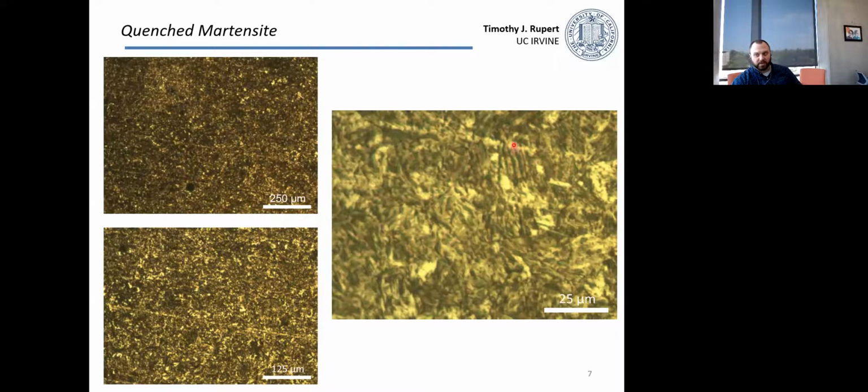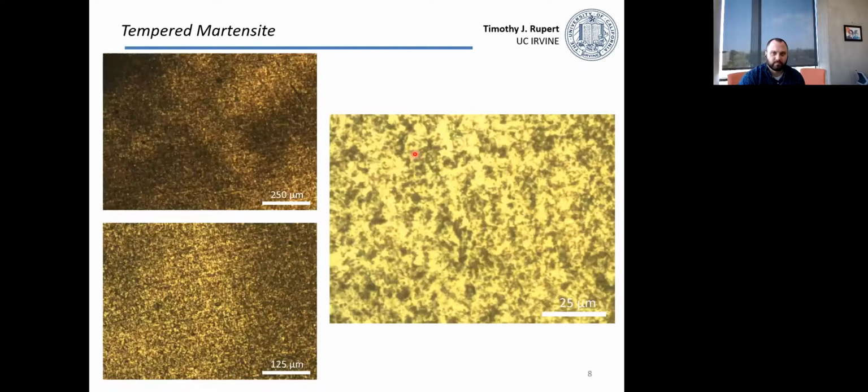So these dark regions, for example, these striped regions here are the martensite. And you can come and find some ferrite in there that's stuck in there. But most of my material is this alternating pattern of very, very dark regions for the martensite.